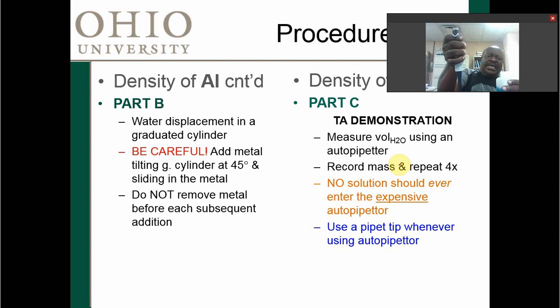In order to make this work and get reliable results, you've got to go to that first resistance point, always the first one. Then you go into the solution to sufficient depth so that you're not pulling up air. And here's an important thing: draw the solution up slowly. Then you have exactly, in this case, 1 milliliter. It shouldn't drip, it shouldn't do anything.